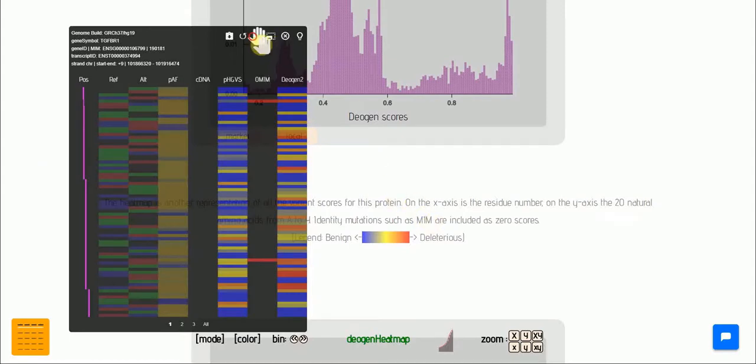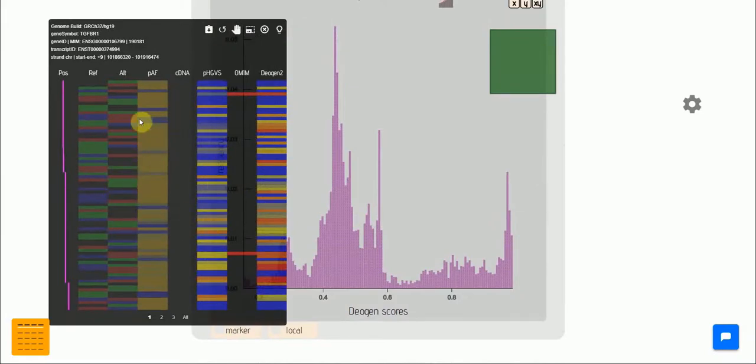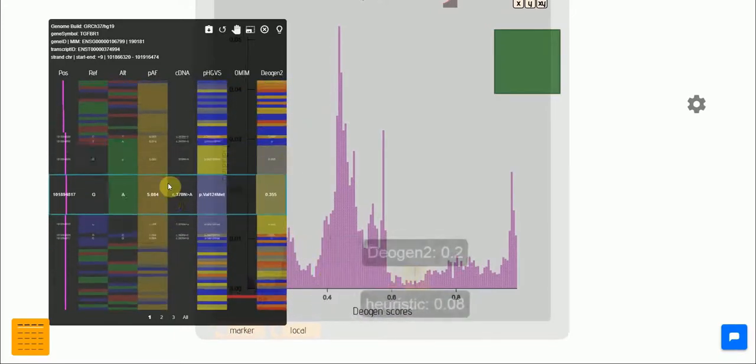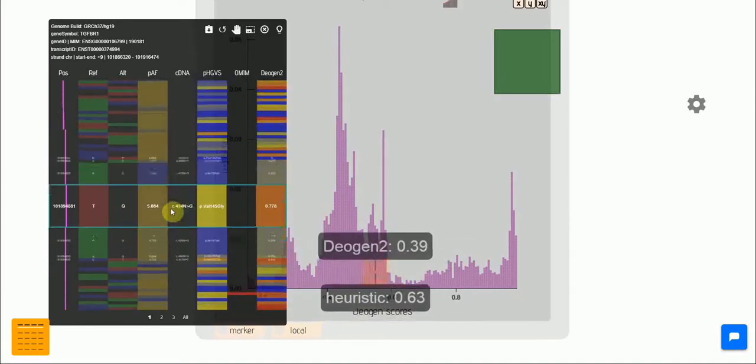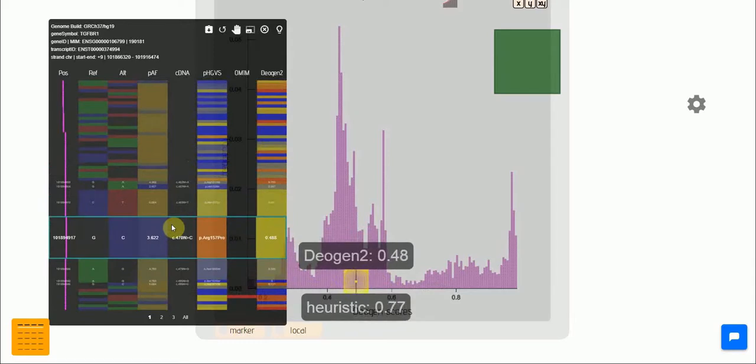So how you can use this is to mouse over any area under the table, and there will be a small brief animation. If you give it a go, about a second till the animation is complete, now you can mouse over or move your touch point. If you're trying this on a mobile device, then it will expand the part that you're looking at. In this case, for example, I'm looking at a mutation from G to C that results in arginine to proline at residue 157. And that will also cross-locate that mutation on the distribution graph.